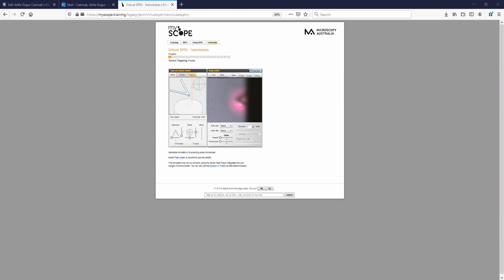We're going to use the motors to move the cantilever beam closer to the sample. And around here, we will use an Auto-engage button because they're really within the vicinity of each other. They're very close to each other. And once we hit the engage button, it will engage the tip with the sample. So maybe a bit more, and then engage now, yes. So it's auto-engaging.